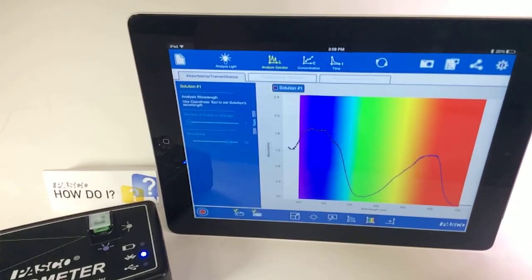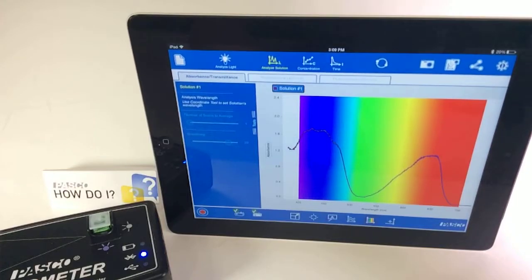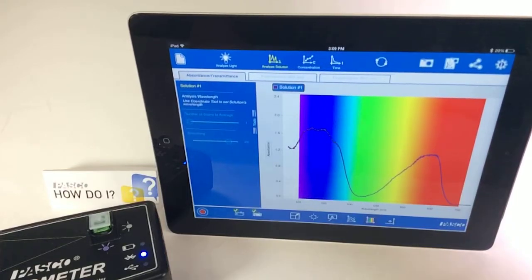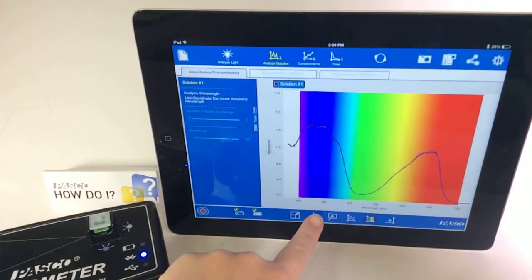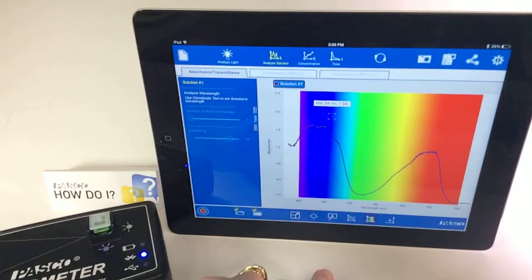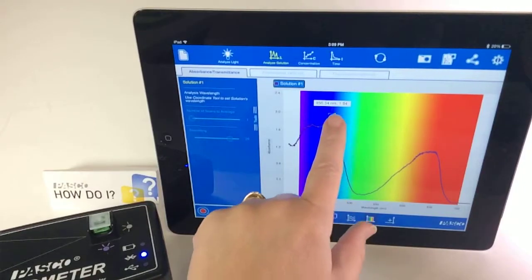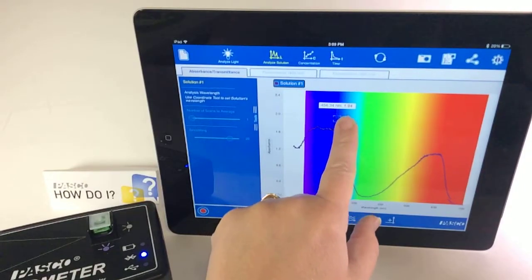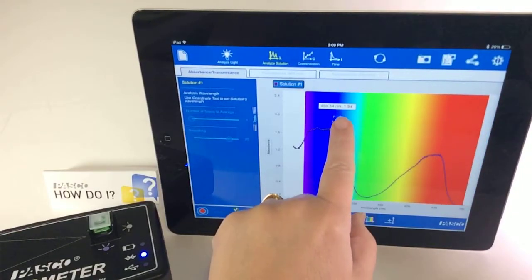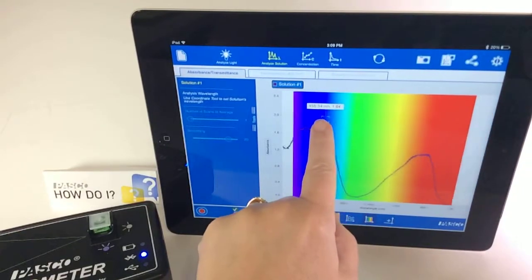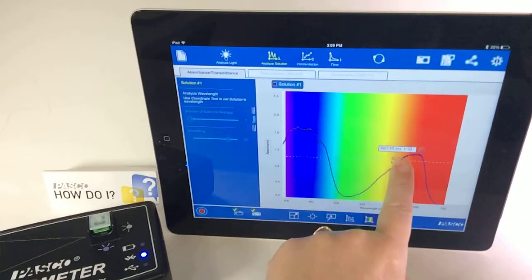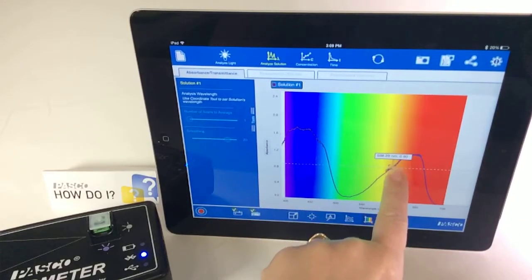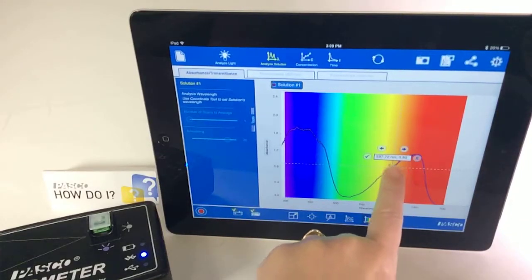And then once I have a curve for the absorbance spectrum of the solution, I'm going to select the coordinates tool, and I get a box that I can drag to any part of the line.